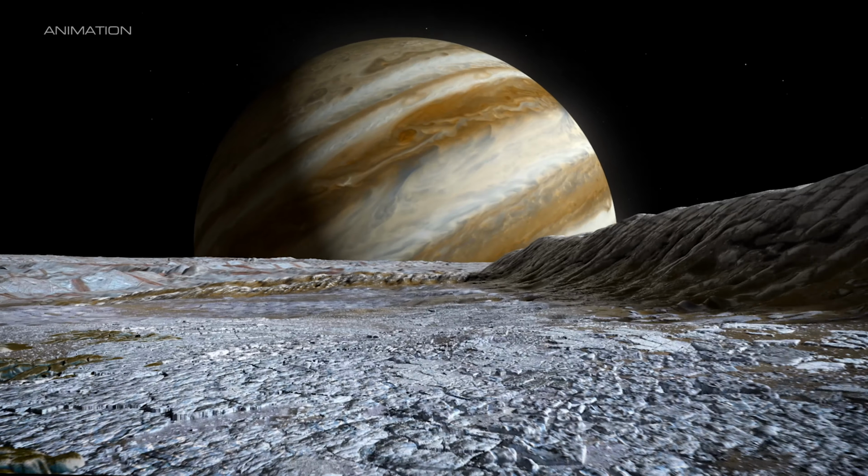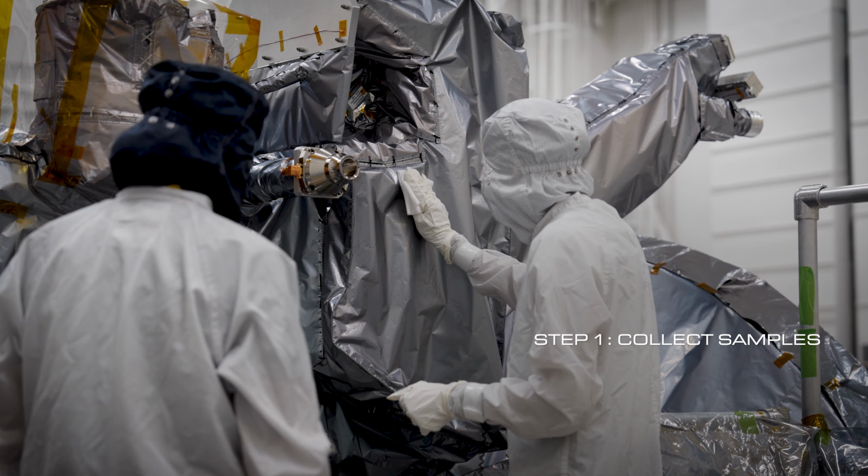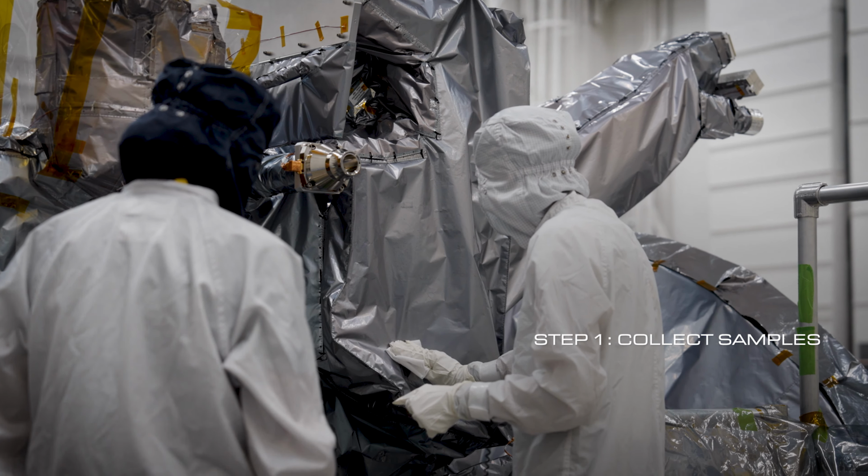We're really helped by this awesome clean room here. It does a lot of the work for us. We also monitor everything that's being brought into the clean room. Everything is very tightly controlled. It's cleaned before it comes in, and we sample anything that is going to come close to the spacecraft. The rules of the game are we're sampling in 3 different directions, and each different direction gets a different face of this wipe. We want to give ourselves the best chance to pick up any bacteria that might be on here.